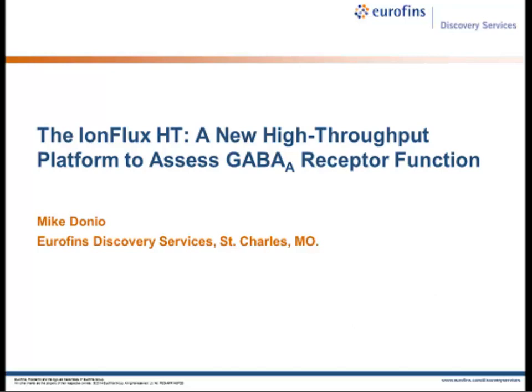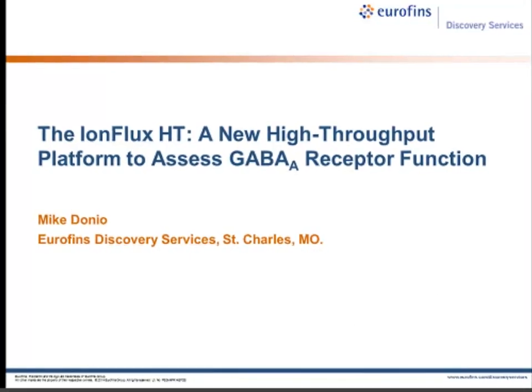So good morning. I just want to start off by thanking Jim and Molecular Devices for the opportunity to come and present some new and exciting data that we've generated here at Eurofins. My talk is going to be looking at some GABAA validation data on the IonFlux HT.